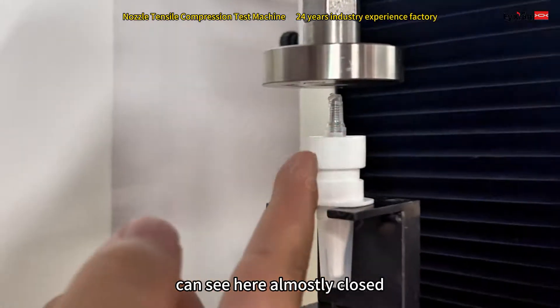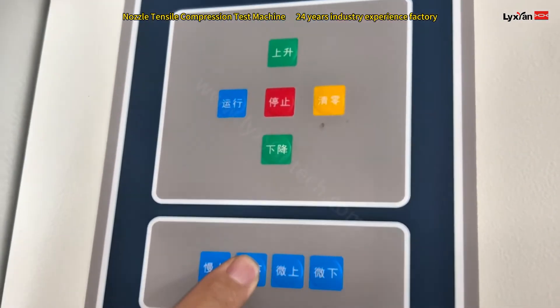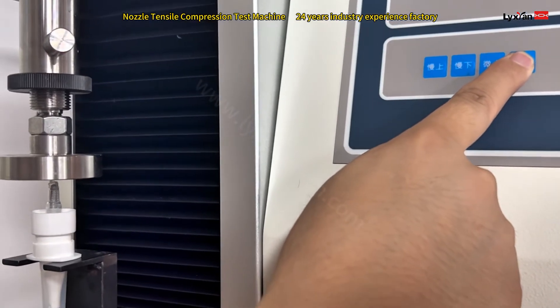You can see here, the clamp is almost closed. So we slowly lower it down, slowly down, almost closed, and then mostly down — very low.